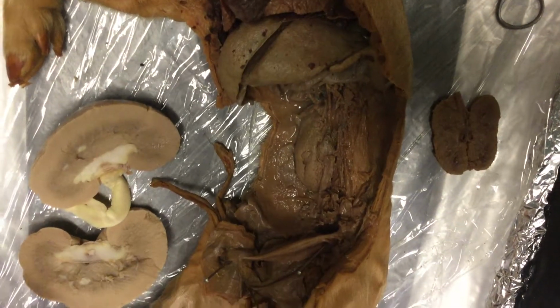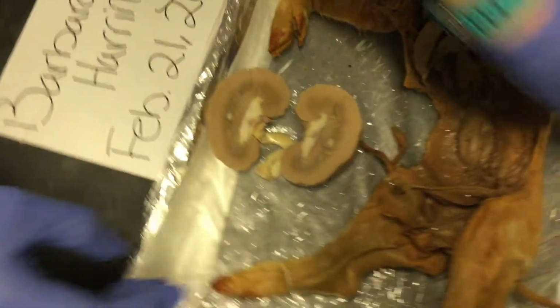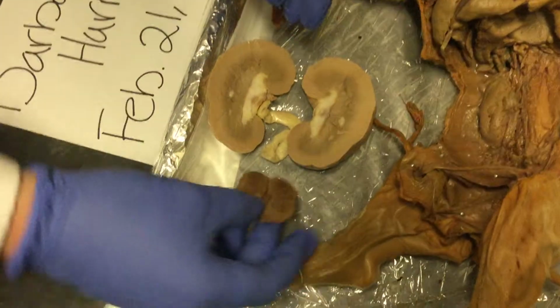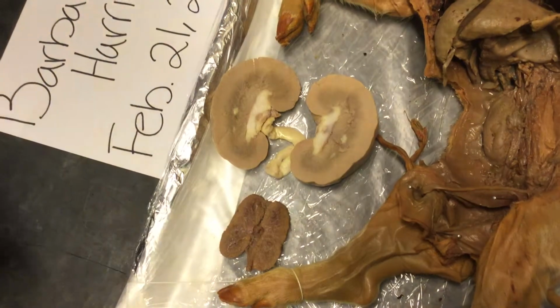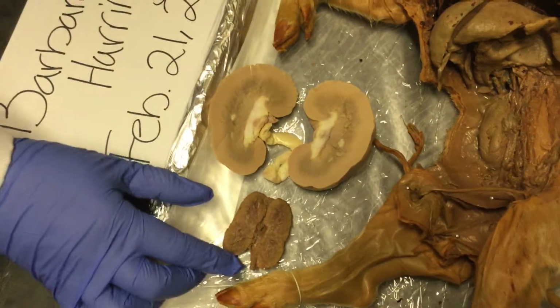With the kidney structures, we also did a dissection of sheep kidneys, and then this is a pig kidney. So with the sheep, we were able to observe the structures a lot better than the pig.